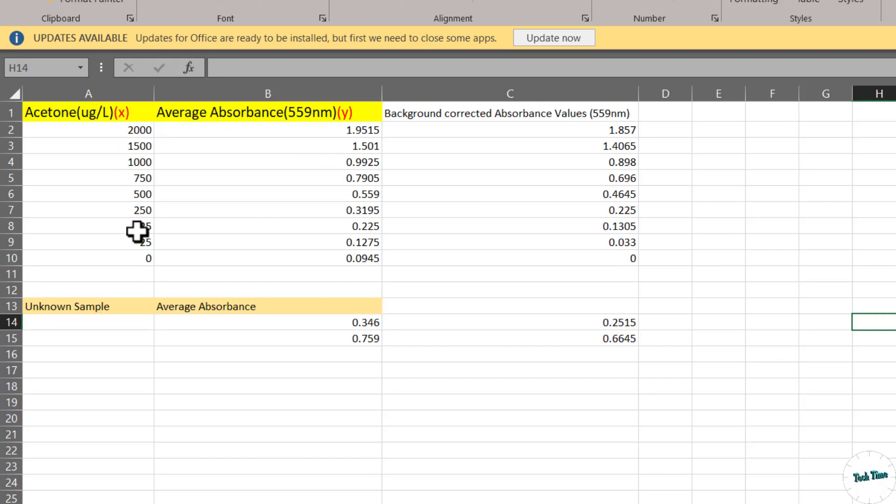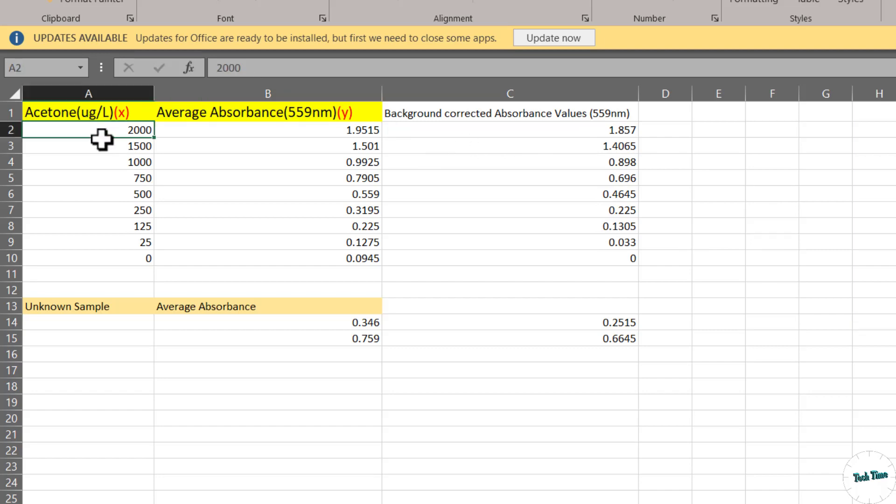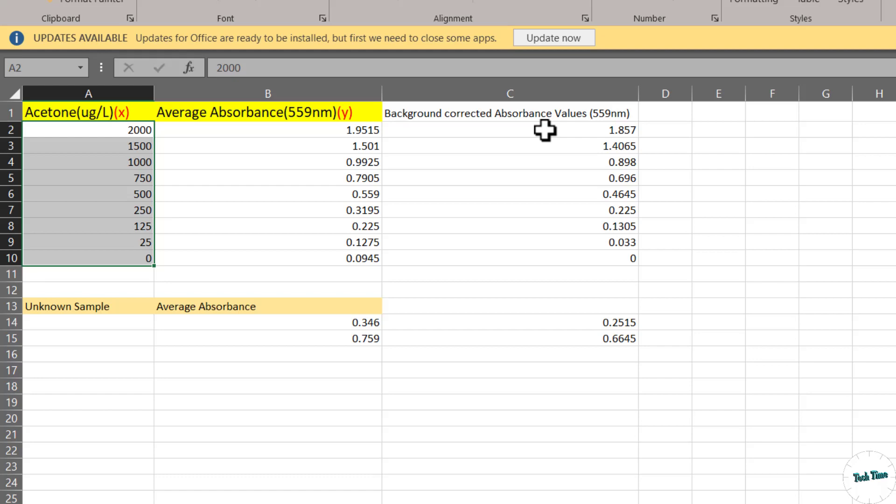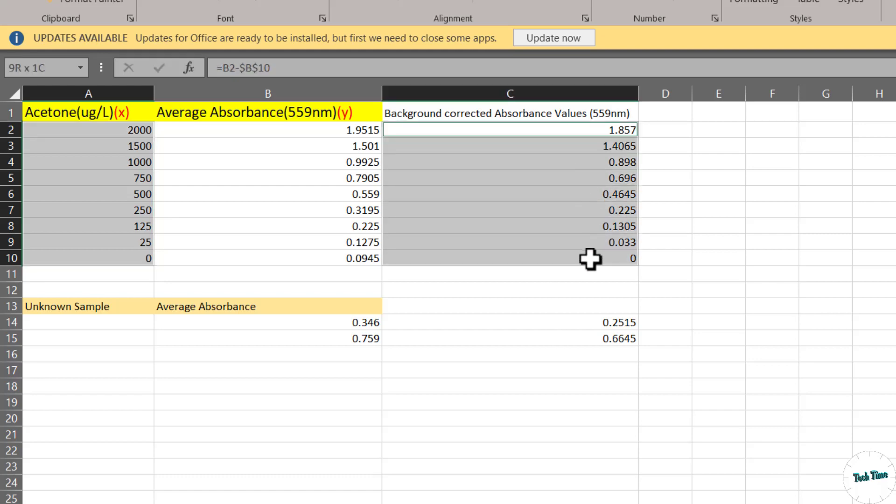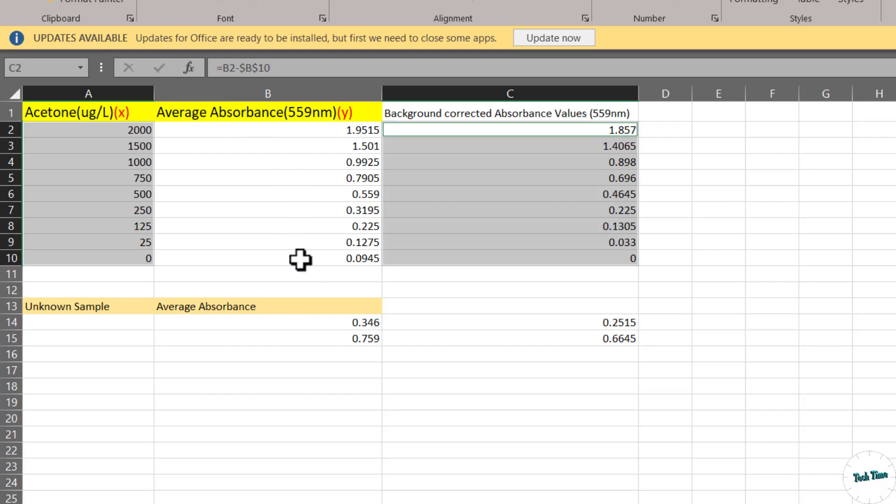Now this is going to be our X value and this is going to be our corrected Y value, average absorbance. I'm going to choose this particular one like this and then hold the control key and select these background corrected absorbance values. You must make sure you don't take the average absorbance value in this B column because they have not been corrected for background absorbance.